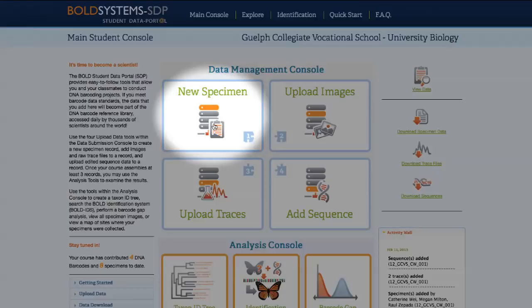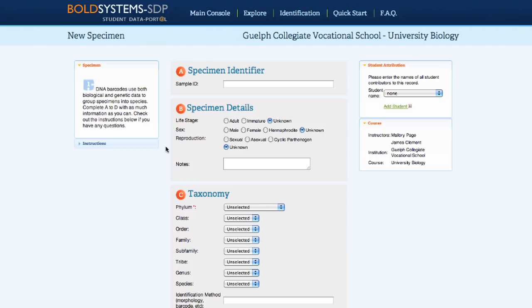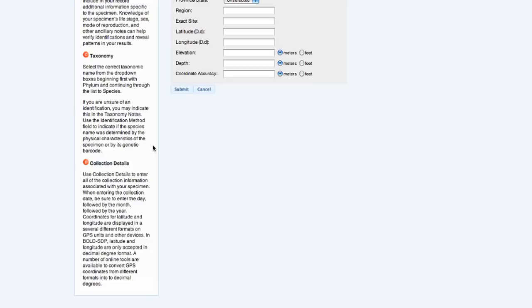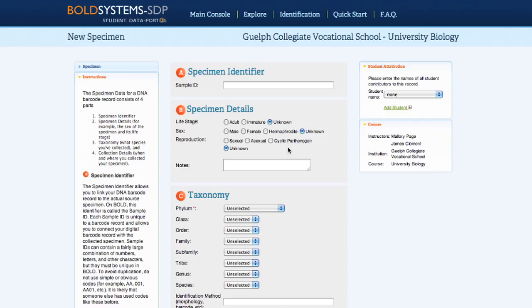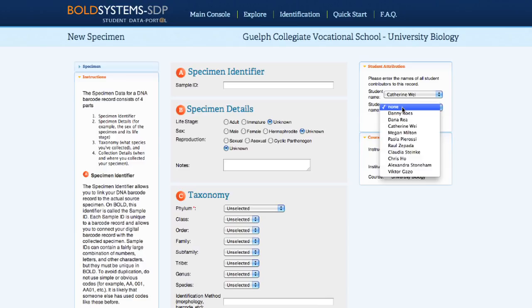Now that you have your specimen ready to upload, click New Specimen. The first step in creating your barcode record on BoldSDP is to upload the specimen data. Instructions are listed along the left-hand side of the specimen data page for easy access. The student attribution is listed in the top right, and multiple students can be selected in case students are working in groups.